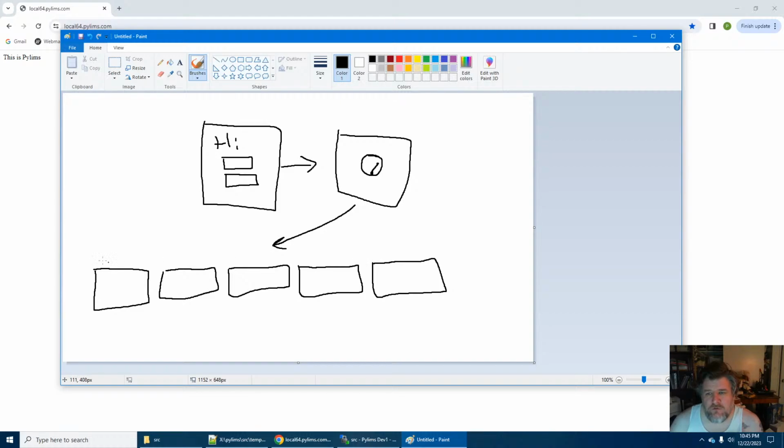So very first thing, I know that we need workflows. We need multiple things for those. So let's say the first thing you need, let's see, protocols. So you can make a protocol. With protocols you can run experiments.